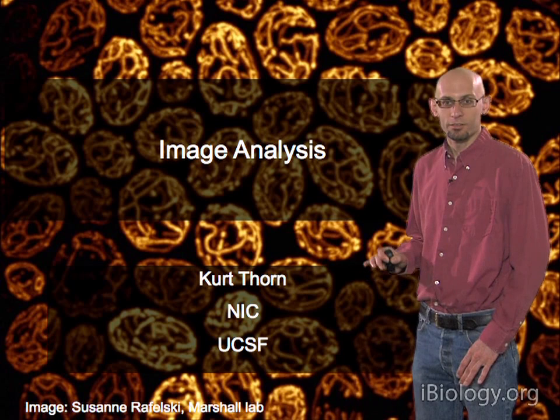The idea in dilation is we drop the structuring element here and match the center 1 with this one here. Then we would set all these 0s to 1s wherever there's a 1 in the structuring element that overlaps with this image. So if you do the dilation, you get basically a big box here that corresponds to dropping that structuring element on these 2 1s.